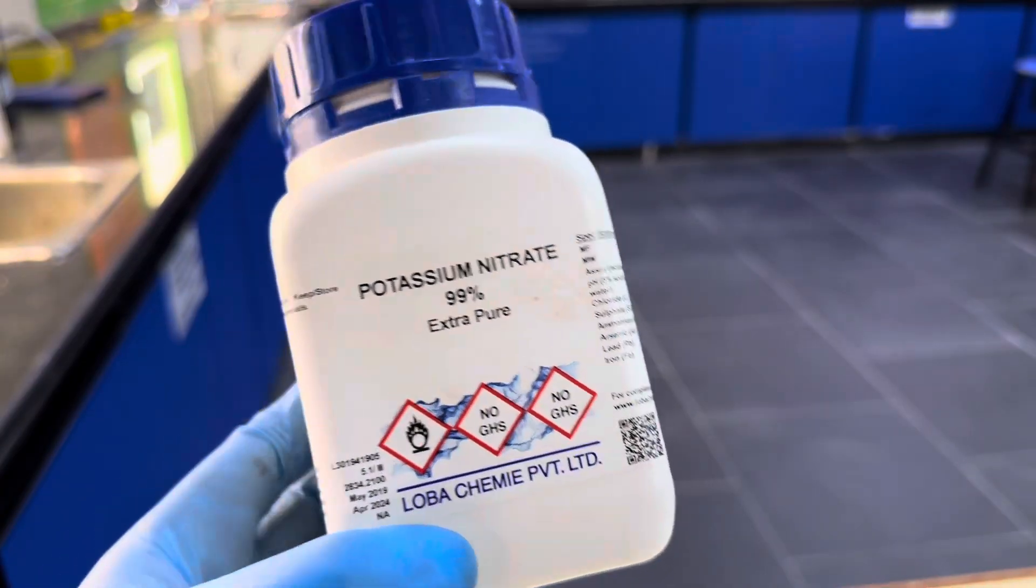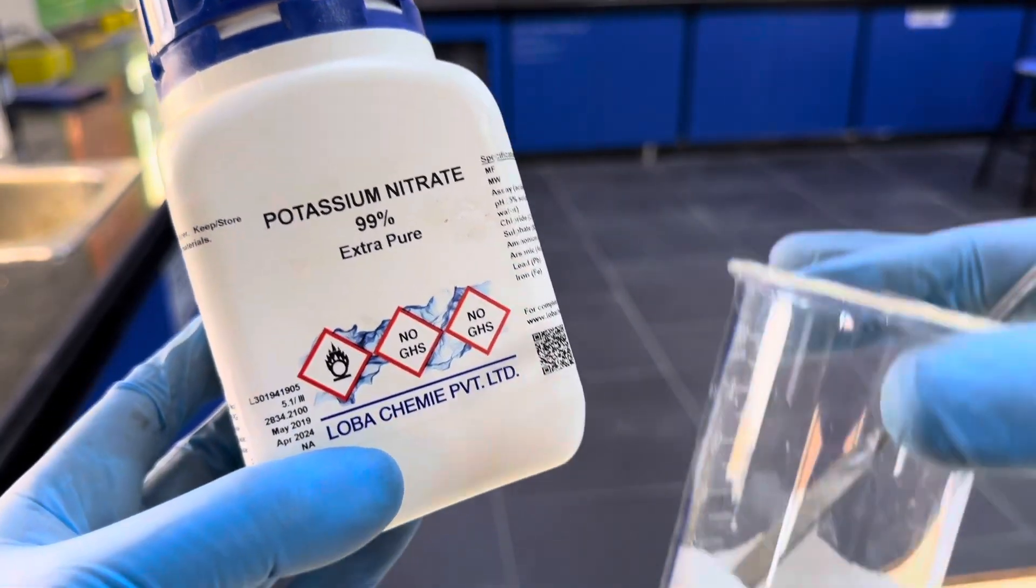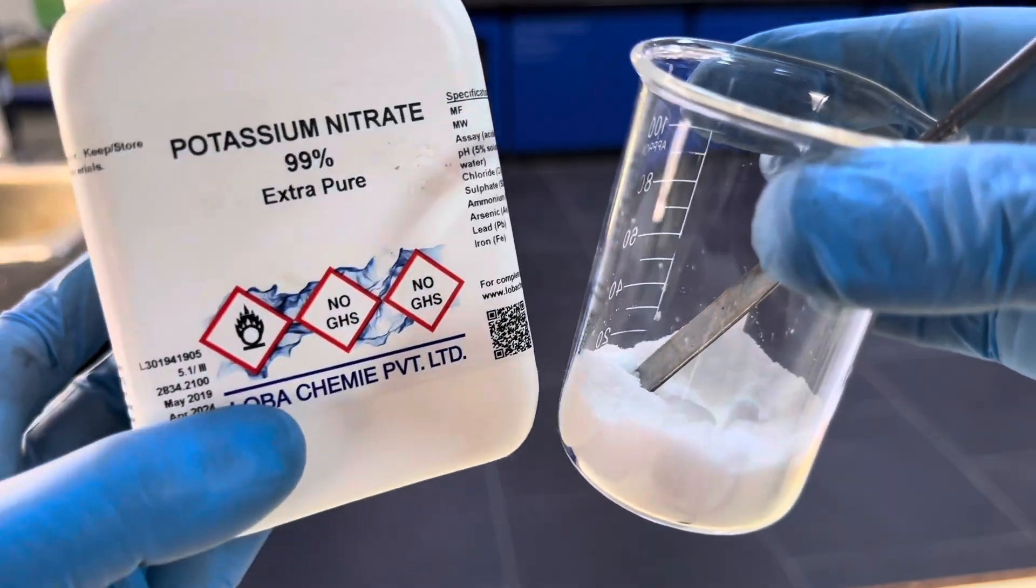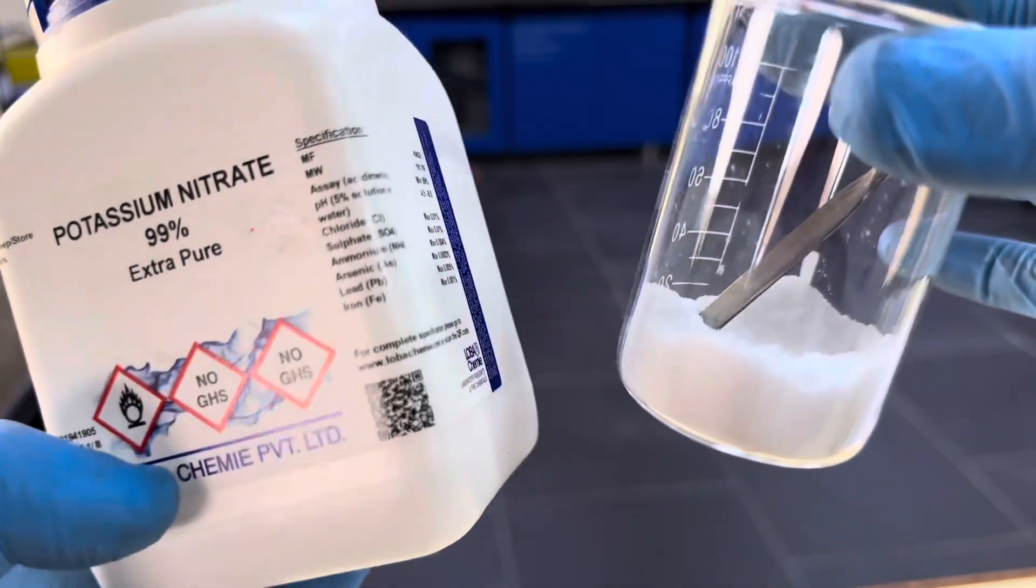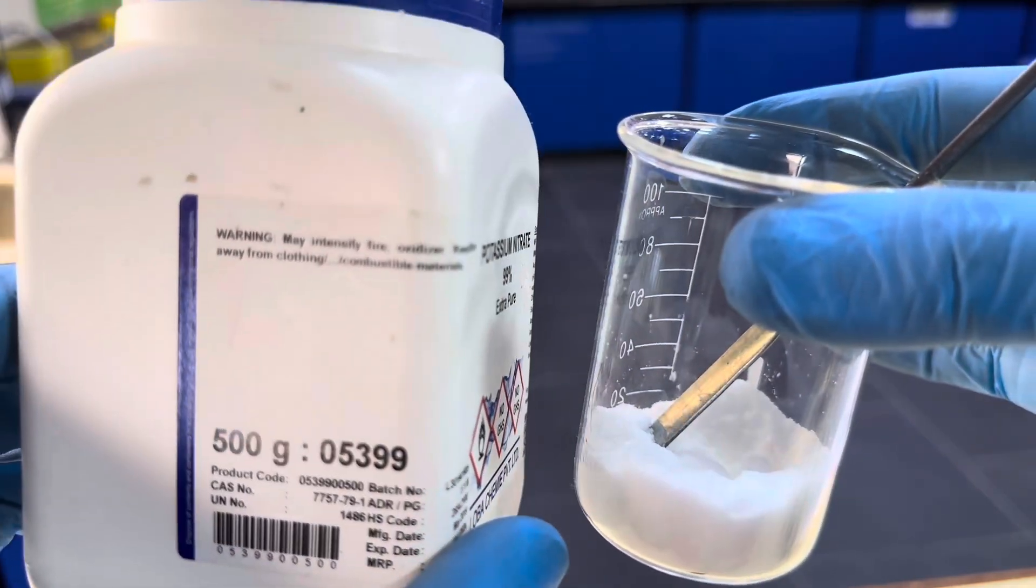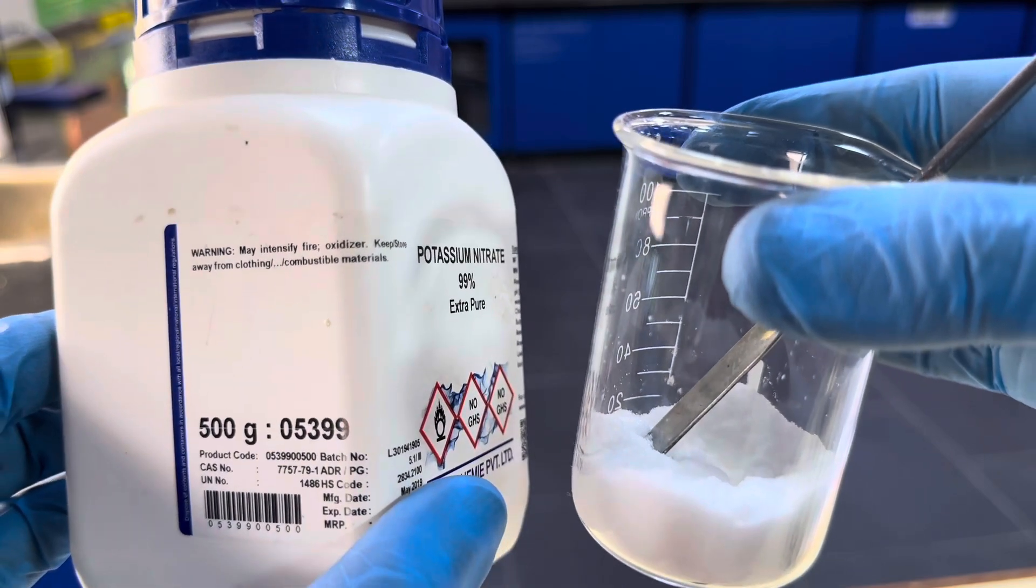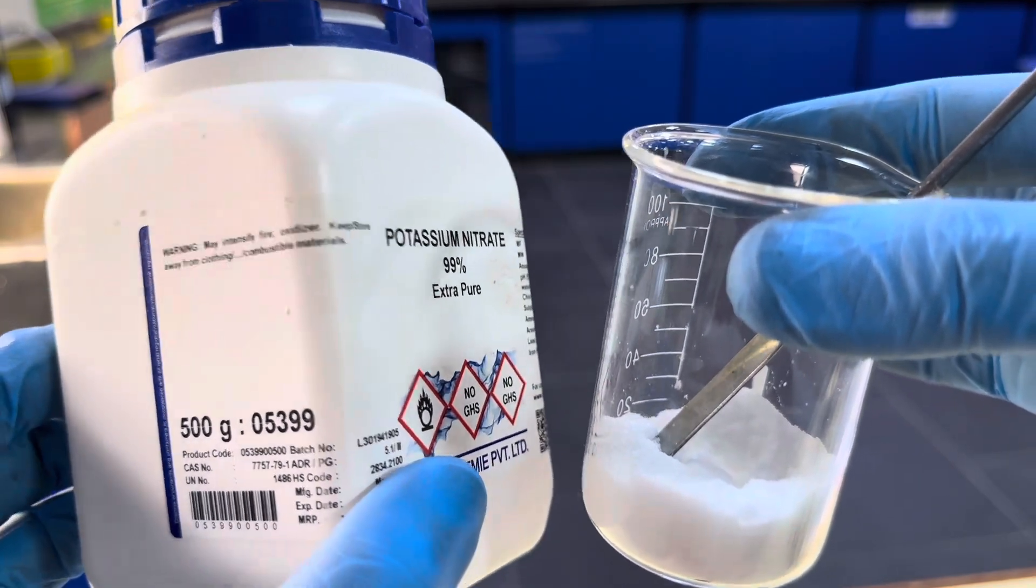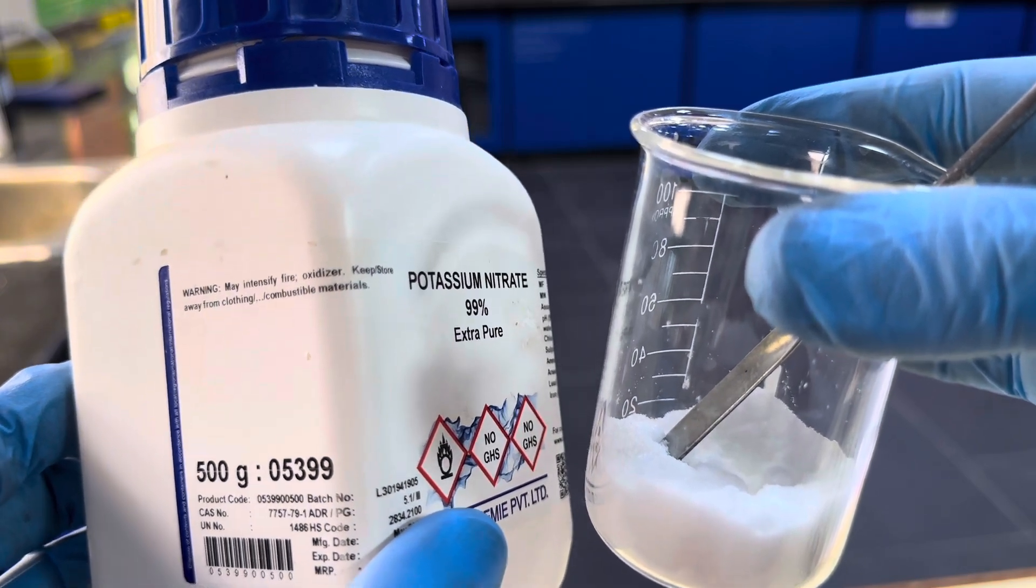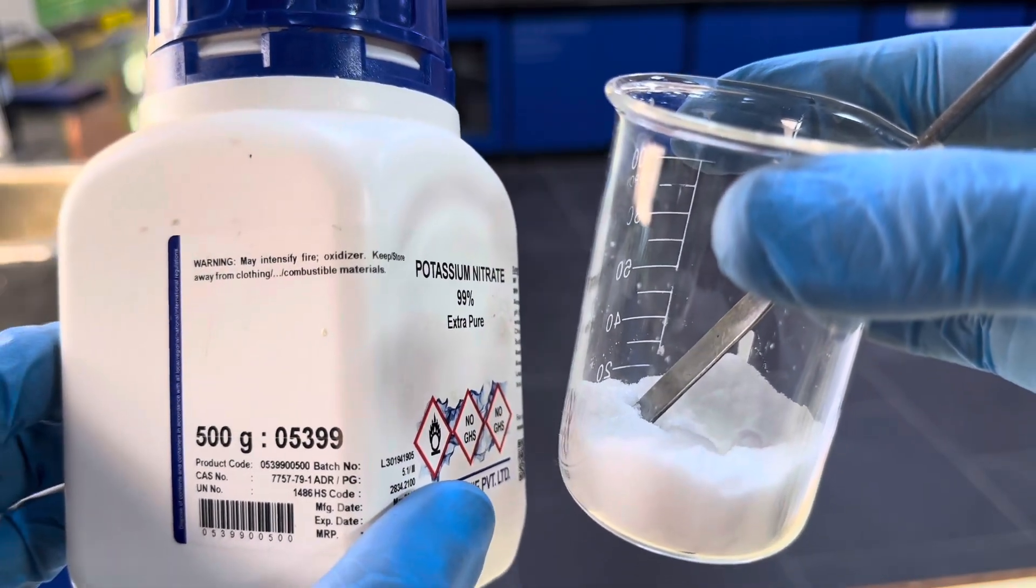This is the potassium nitrate and it appears as a white powder. It's an oxidizing agent so we have to store it in a place that's quite far away from where all of the other chemicals are. It may intensify fire, so you have to be careful and keep it away from clothing or any other combustible materials.